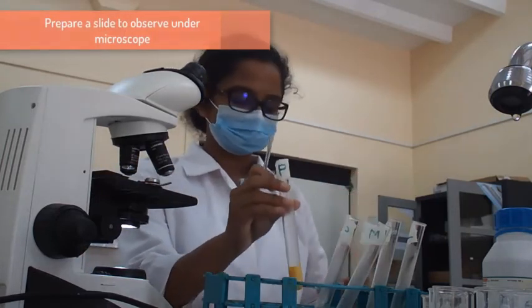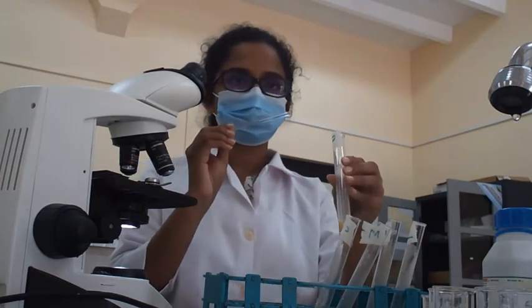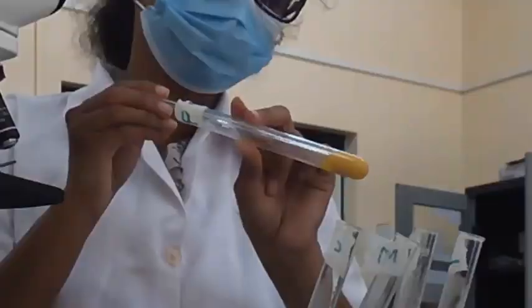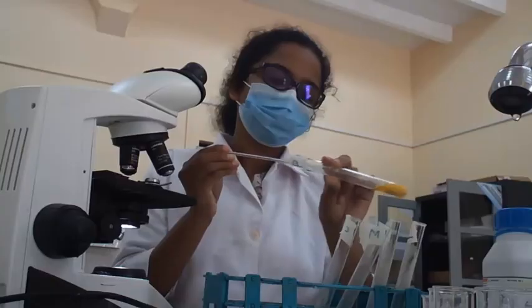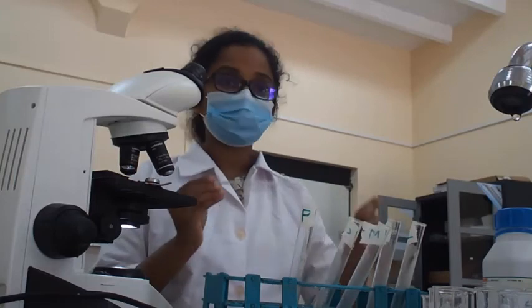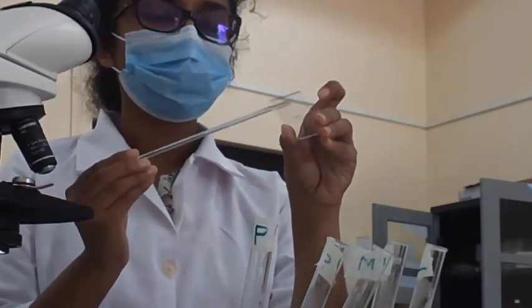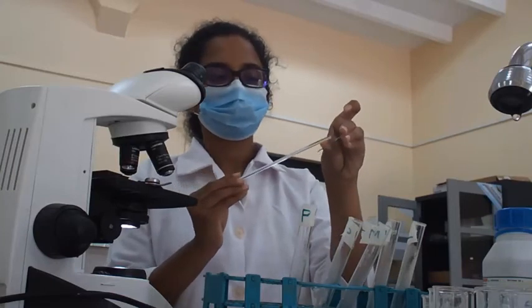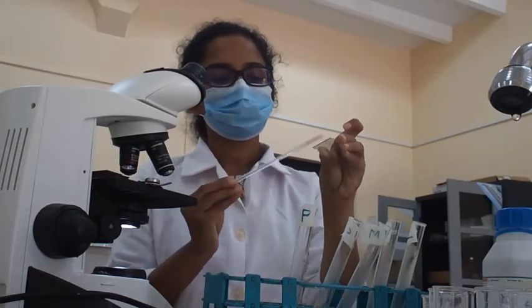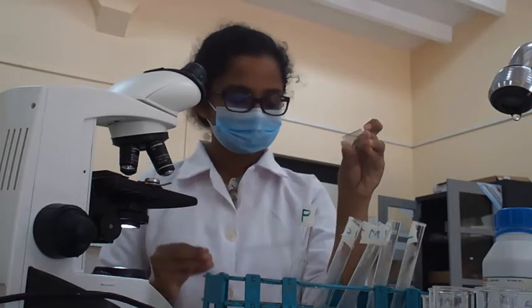and we take a glass rod and take some crystals formed, and place it over the glass slide.